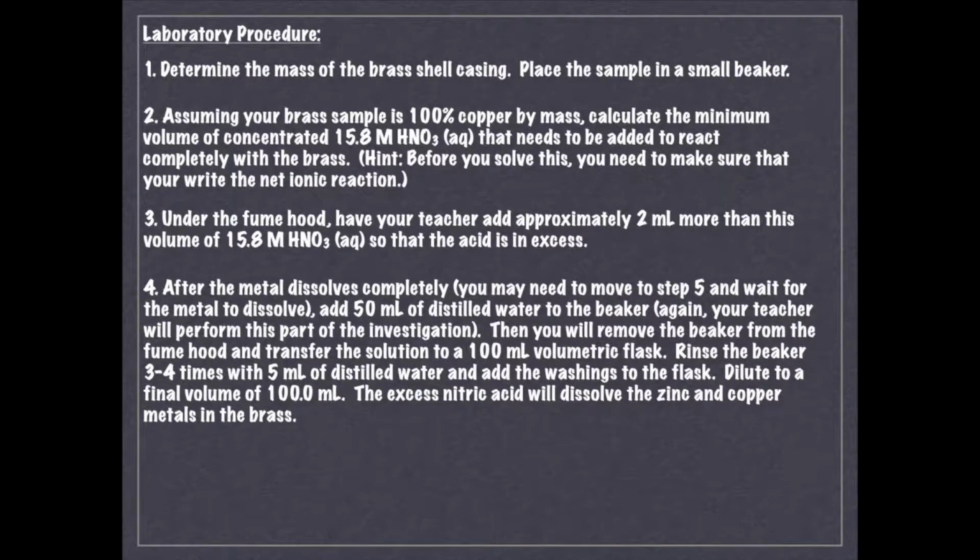So this is what you're going to do after we've created the Beer's Law curve, after you've given the nitric acid the opportunity to dissolve away your shell casing. The reason I didn't show this is that I want it to be a surprise. I want you guys to see what it looks like. So you just have to follow the instructions, and it's pretty simple.